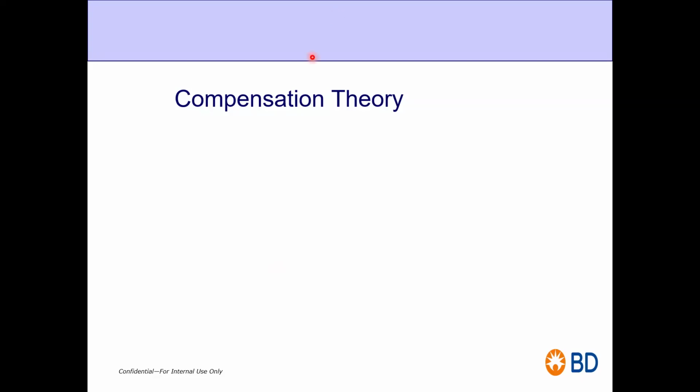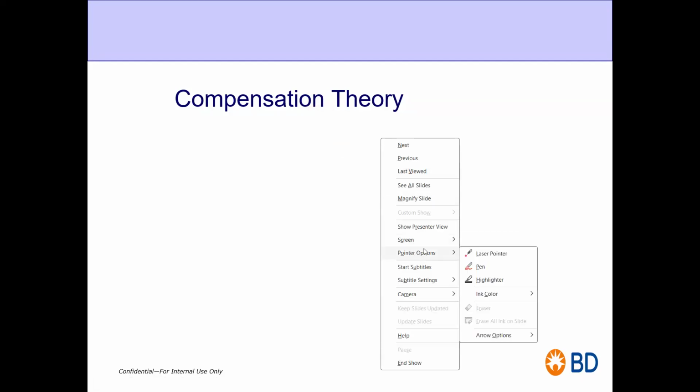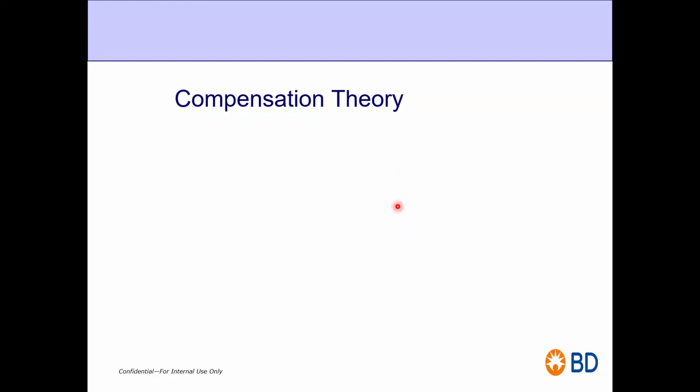Fine. Thanks, Neha. Let's talk about the compensation theory. What does compensation theory mean?